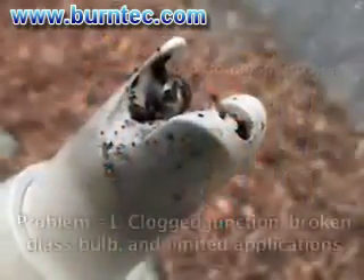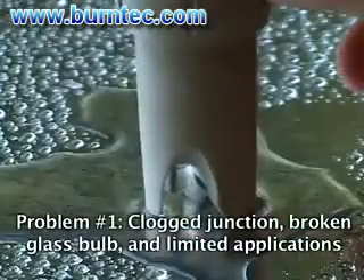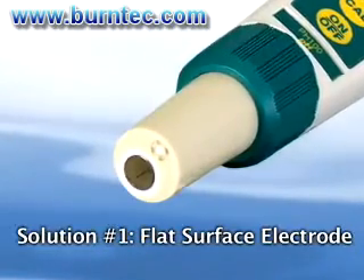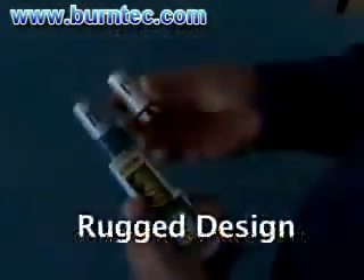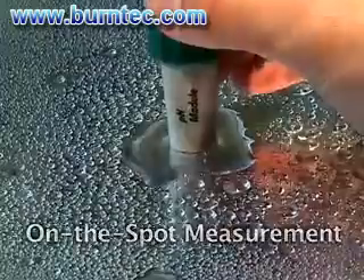Problem number one: traditional glass bulb pH electrodes tend to get clogged or easily broken and are limited to liquid measurements. Solution: the ExDIC pH meter is the world's first stick-sized pH meter designed with a flat surface electrode. Its rugged design can withstand harsh environments and can also measure on solids and semi-solids.